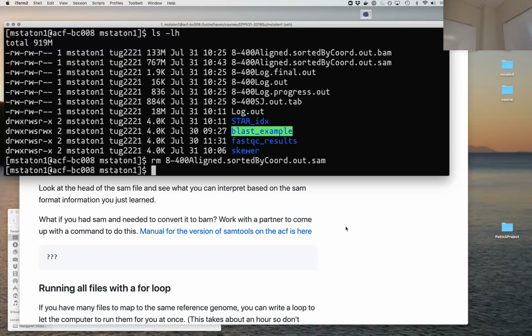Okay. Anybody still working on the problem? Yes, that's everybody. So everybody use the lowercase b as the flag. And that's how you go the other direction, from SAM to BAM. And I have guesses only for why. Extra credit to anybody who can figure it out.